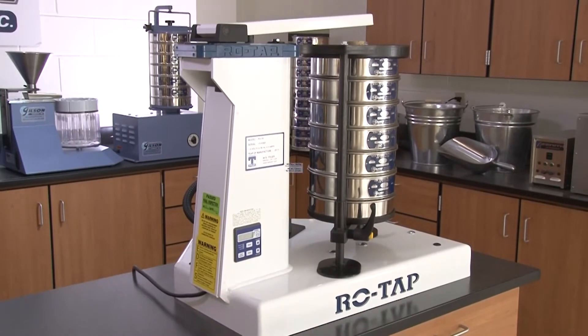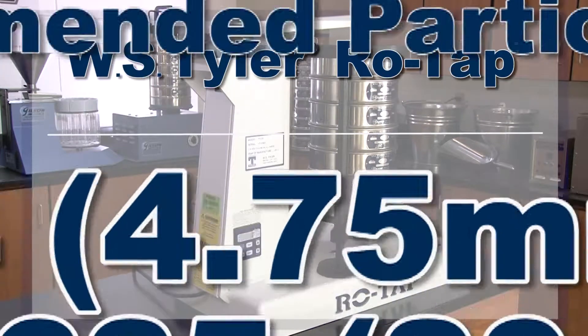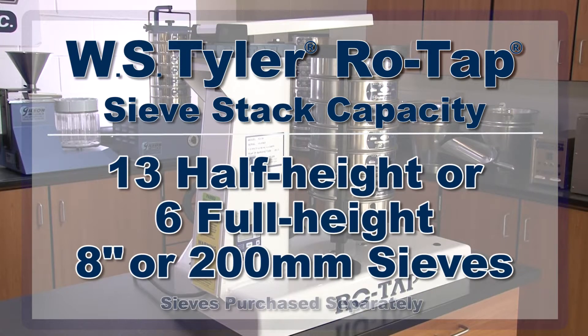With a recommended particle size range from number 4 to number 635, the RowTap Tapping Sieve Shaker can hold up to 13 half-height or 6 full-height 8-inch test sieves plus a pan.